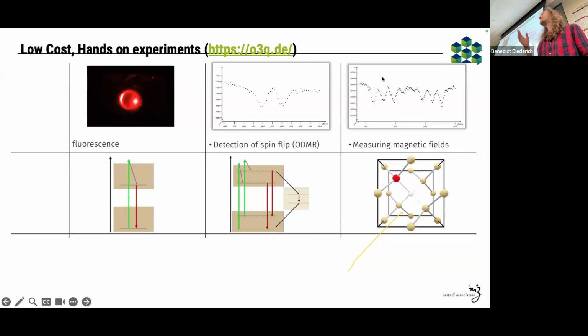So in the end, I'm skipping a lot of theory. You have a magnetic field sensor. So the fluorescence is depending on magnetism. And I'm always wondering how you can apply that to biology, because I think these diamonds can be very small, and you can also attach them somehow, put them into the cell and then use that eventually. And they're pretty bright, will never bleach.